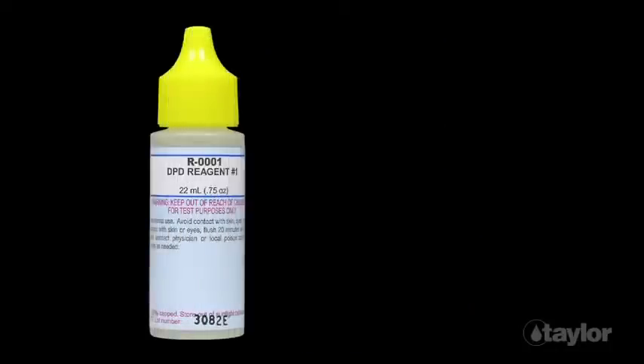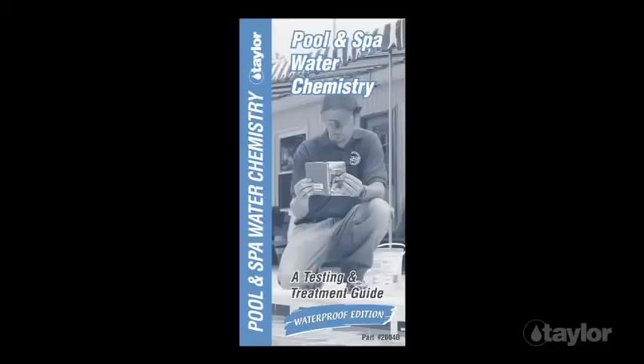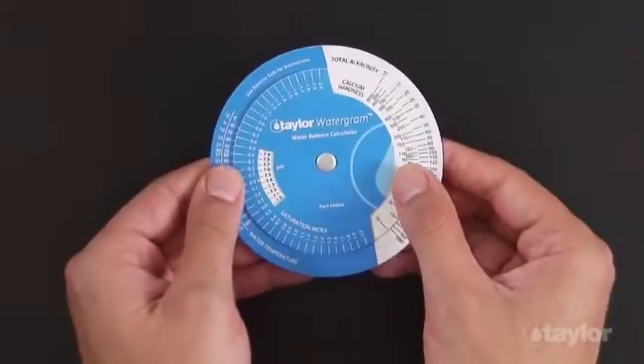Liquid reagents come in ¾ ounce dropper bottles. The DPD powder is in a 10 gram vial. The kit also includes a comprehensive testing and treatment guide, plus Taylor's unique Watergram.